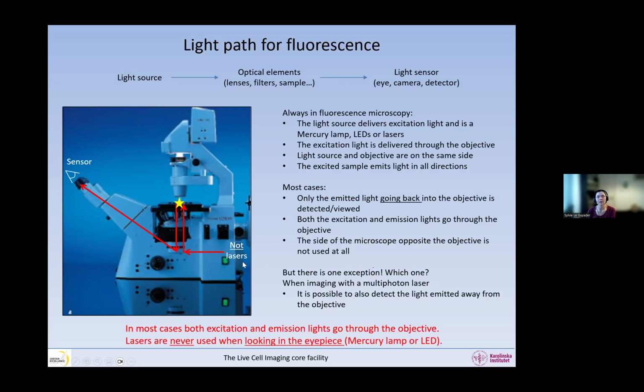So can you tell me on your confocal microscopes, what type of light sources you have? How many light sources do you have on your confocal, point confocal microscope?